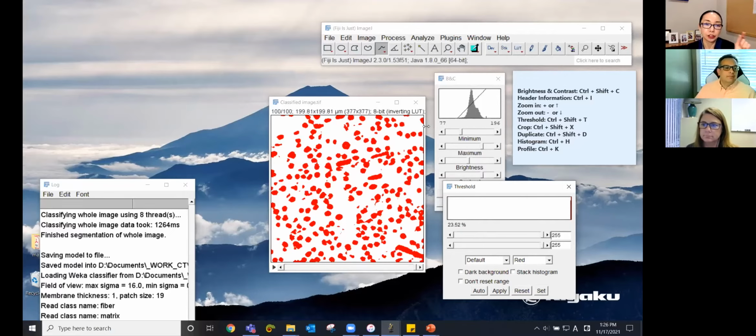It skews the results. So when you do size distribution, and if you don't have millions of particles, it's a good practice to get rid of the edge touching particles. Francesco says some commercial software has this. ImageJ does not, so if somebody wants it, they'll probably have to develop that little plugin themselves.